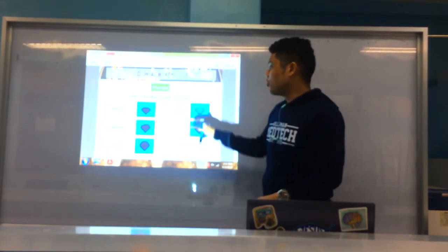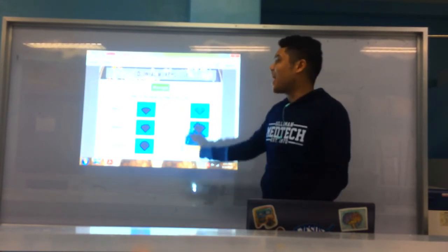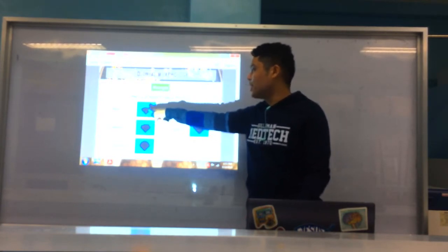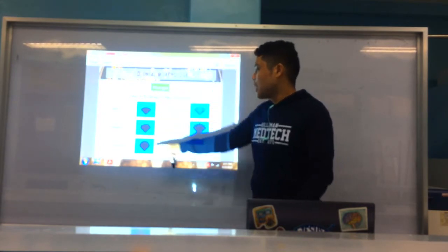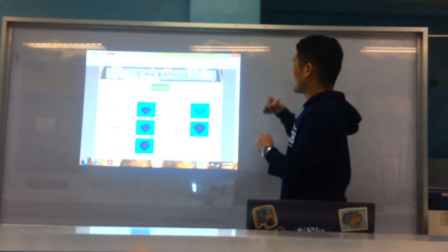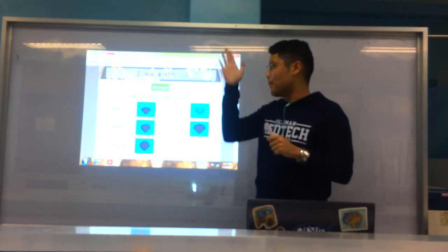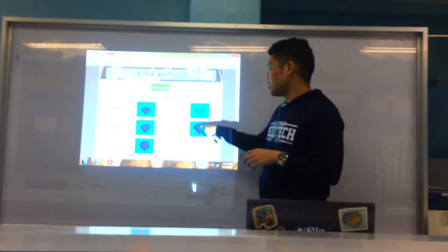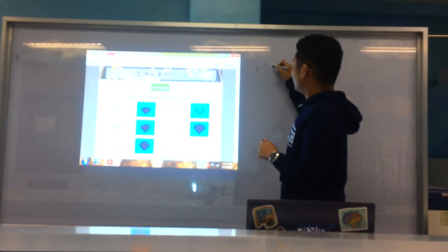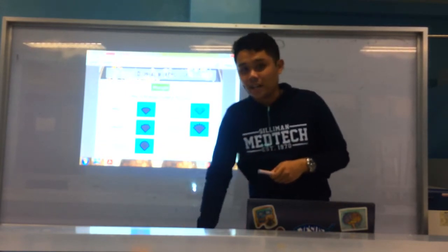Next for margin, so the edge of the colony, the edge of glory, joke. Okay. Edge of the colony, you have entire, meaning it's fairly smooth, no? Undulate has protrusions. Filamentous again has fibers, or in a way small protrusions. Curled is like this, all right? And then lobate, which looks like fingers. But you observe this on the colony. So the edge, you observe the edge. Okay, that's the point for margin of the colonies.